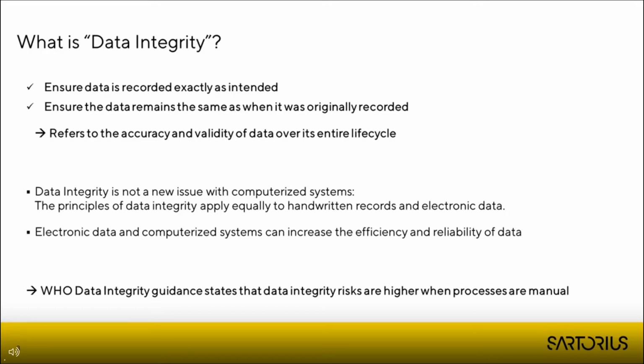And the principle of data integrity also applies to handwritten records or hybrid systems, like when you transfer your data manually from an instrument to an Excel notebook or to a LIMS system. So it's not only a topic that comes with computerized systems.